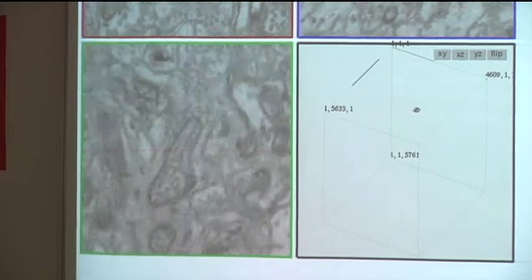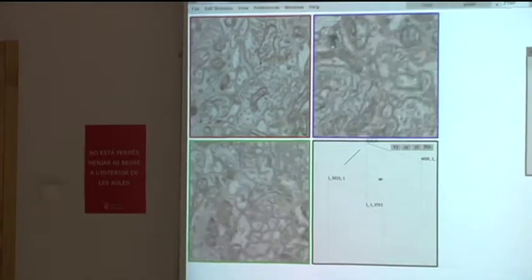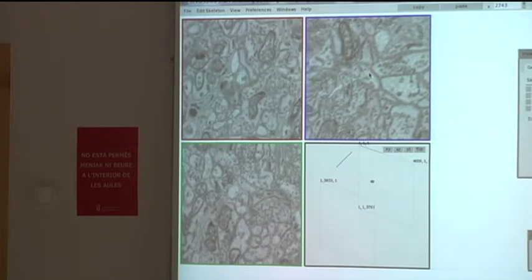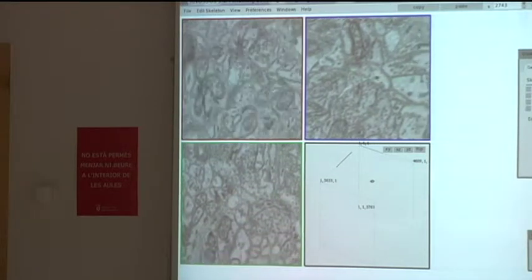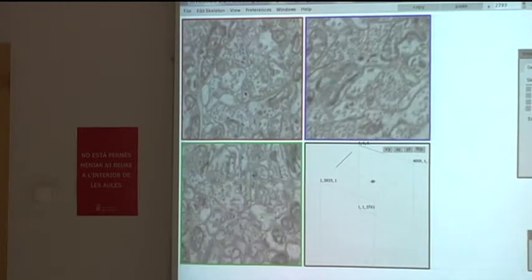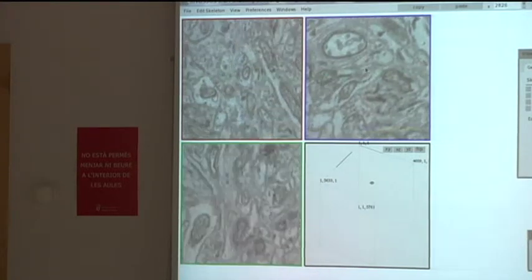And the other thing that can be there are microtubules, which also can look like a vesicle in a reslice. For instance, here, this particular process contains those two dots, which are not vesicles, I think at least, but are more likely to run for a little bit longer, as they do here, and maybe microtubules. So there's a lot of small stuff, but the only reason I'm showing you the small stuff is that you can get rid of it visually.